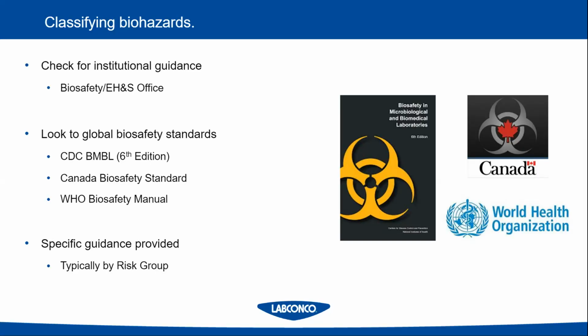Those classifications can be found with several resources. And I always like to say the first and best resource when thinking about biohazards and doing work in the lab with biohazards is your institution's biosafety officer or environmental health and safety office. These are experts on working with biohazards, containment, and safe handling practices, and they are really your go-to people on campus or at your institution. But there are also several other resources out there.